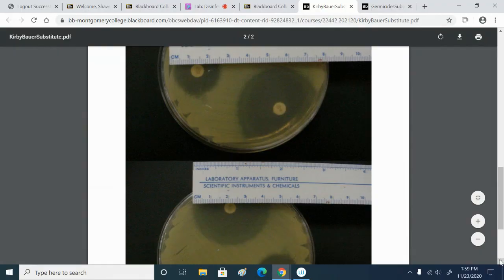So if it's 15 or more and the number is 15, it's susceptible. It's still susceptible. Okay. Right, but it's right there on the border.